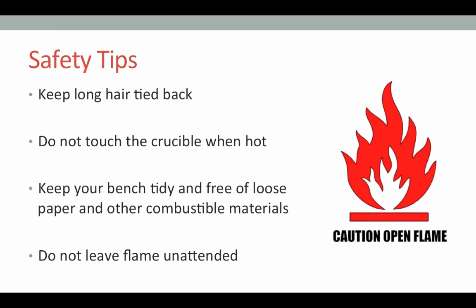Also, again, because of the open flames, it's important to keep your benches tidy and free of loose papers such as paper towels and such to avoid the chance of an accidental fire. And also, very important, never leave your lit Bunsen burner unattended. Turn it off before you walk away or leave your lab partner watching it.